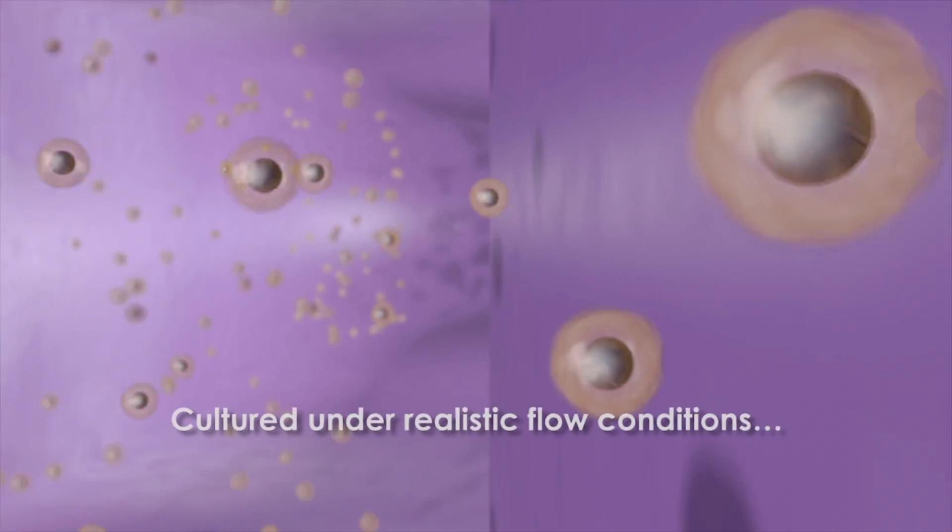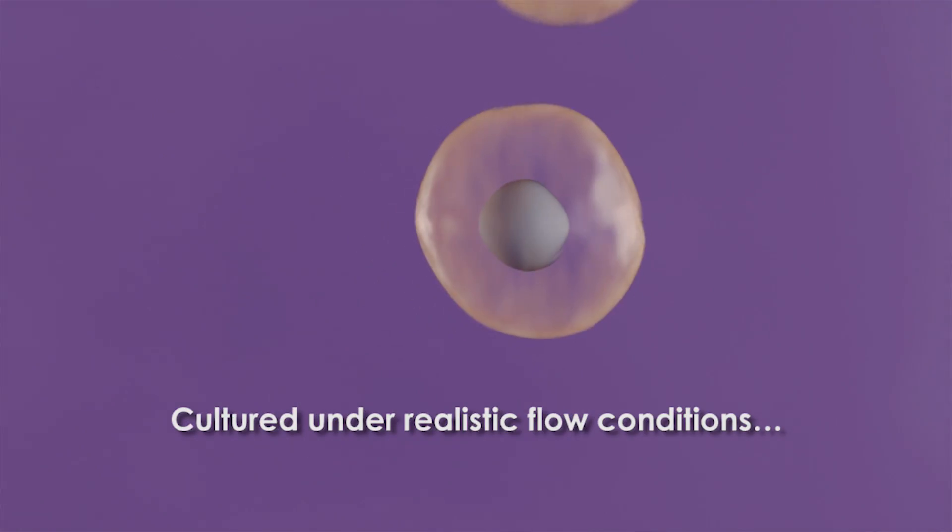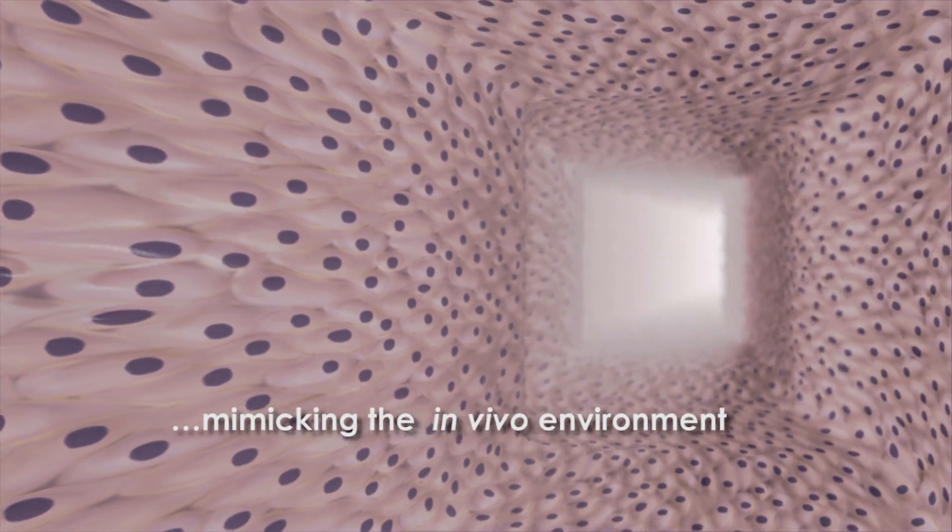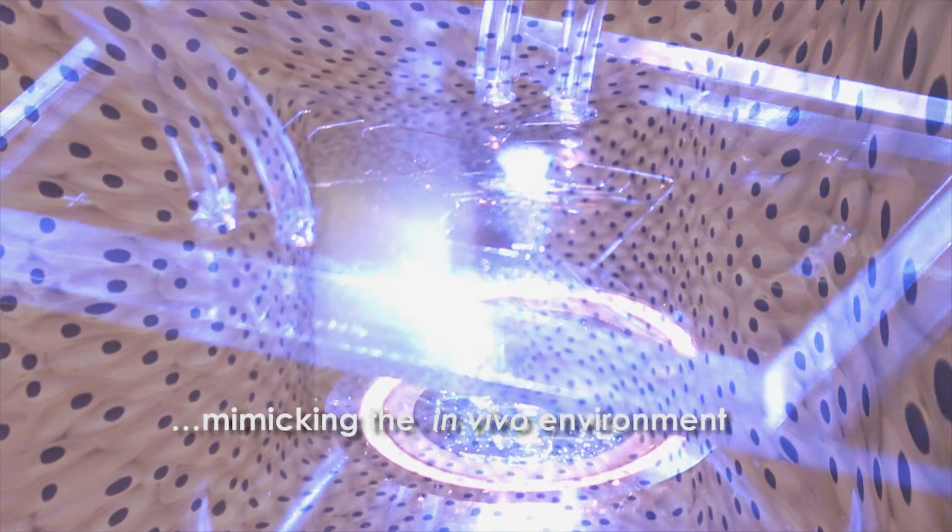The cells attach to the channel walls and are cultured under realistic flow conditions. This results in a confluent layer of cells grown under continuous physiological flow and shear conditions, with morphology and phenotype mimicking the in vivo environment.